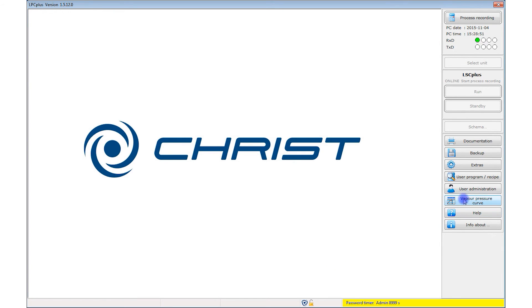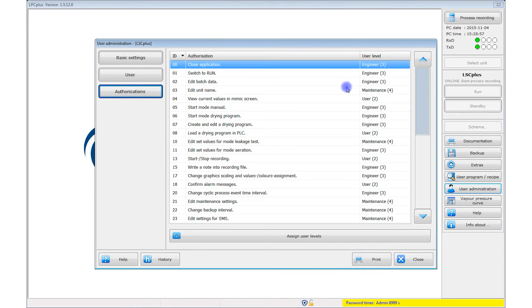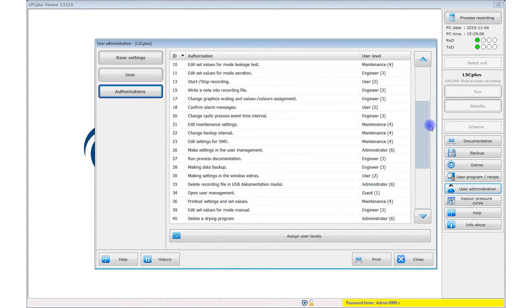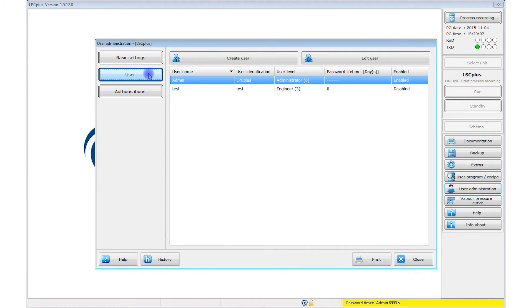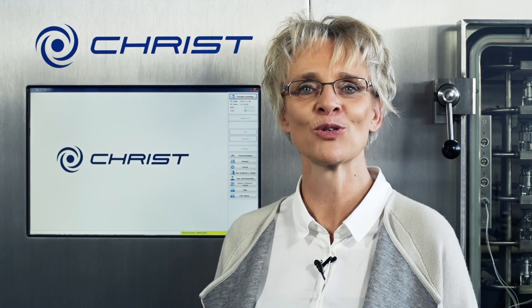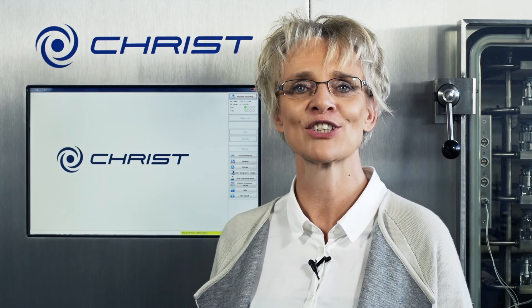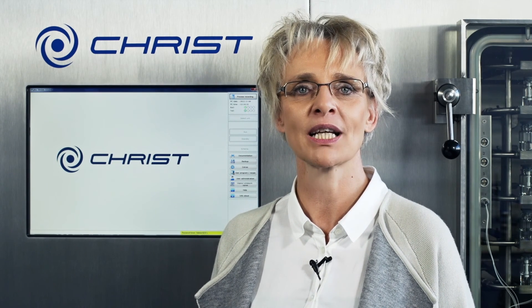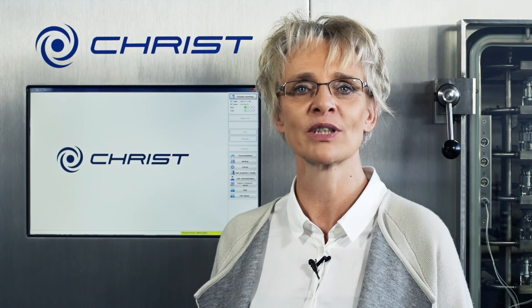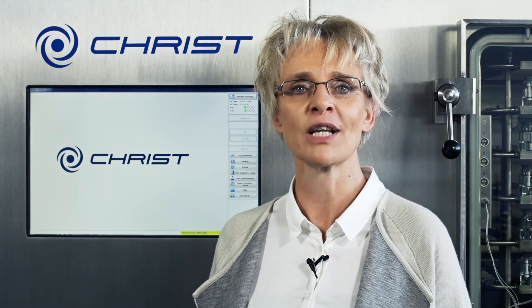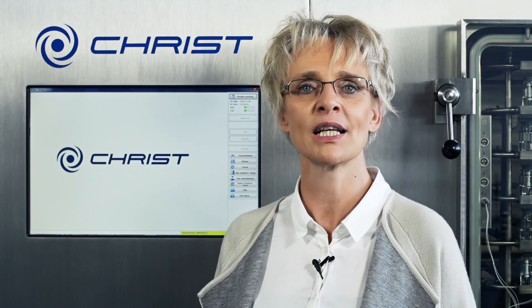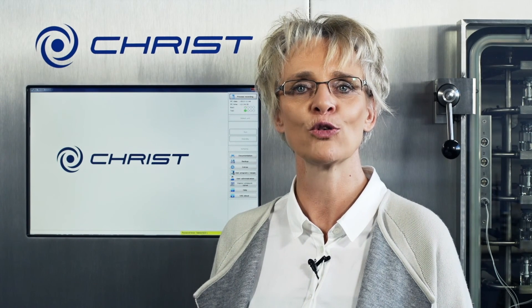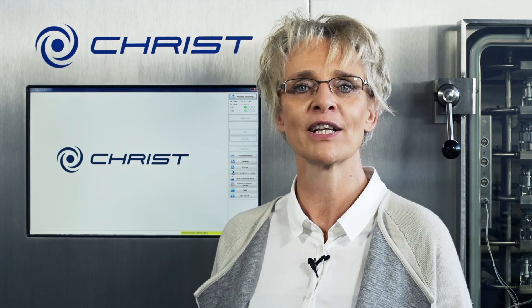Detailed user administration allows each user to be assigned a specific role for using LPC plus. This ensures secure access control. Each user is granted defined access permissions for the functions needed to do their job. The LPC plus software provides numerous individual settings and options for a very wide variety of freeze drying tasks. We maintain and update LPC plus in-house to meet your wishes and optimize freeze drying processes, with a focus on your applications and the requirements of your products.